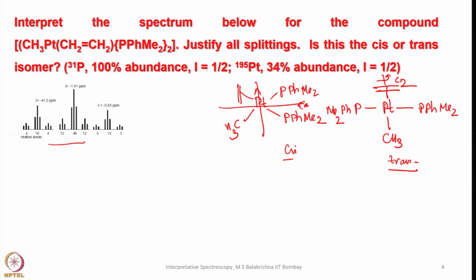If it is platinum NMR, it would couple first with one phosphorus as a doublet and then another doublet, again a doublet of doublets, and there is a possibility of long-range or 2-bond platinum to hydrogen coupling. Then there would be some sort of satellites, or if you take platinum then it should be a doublet of triplets or quartets. That is not there.